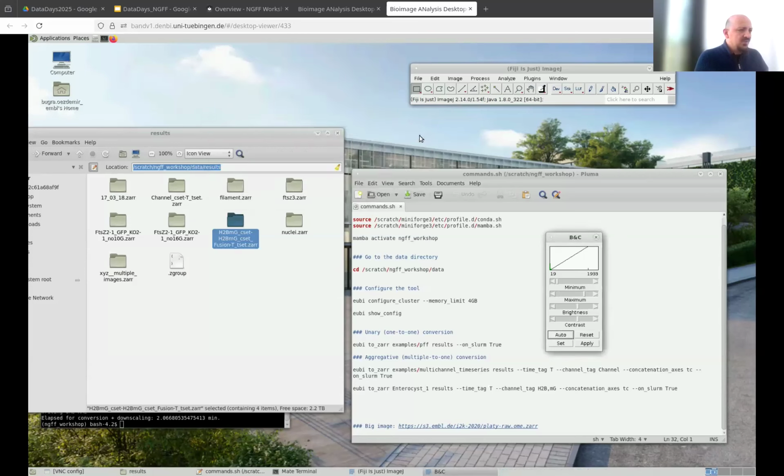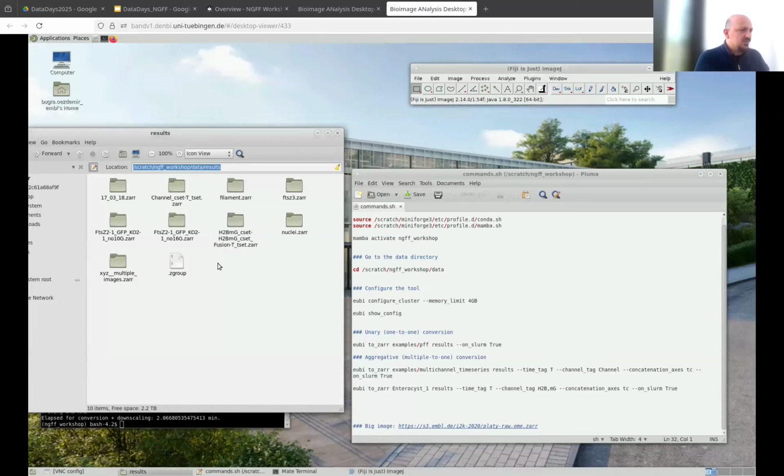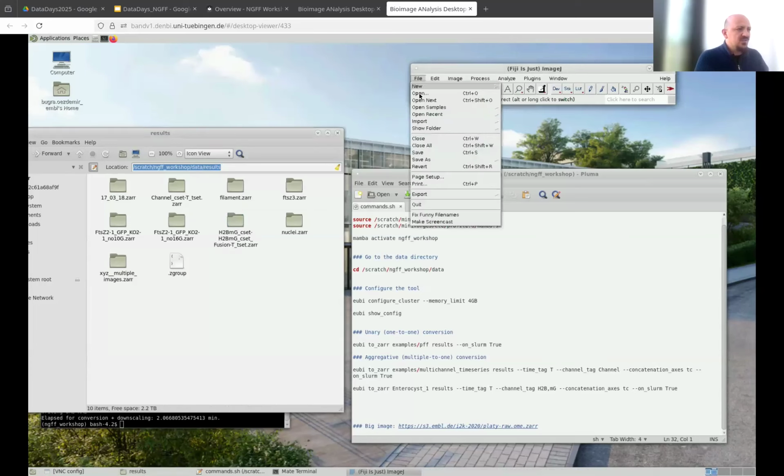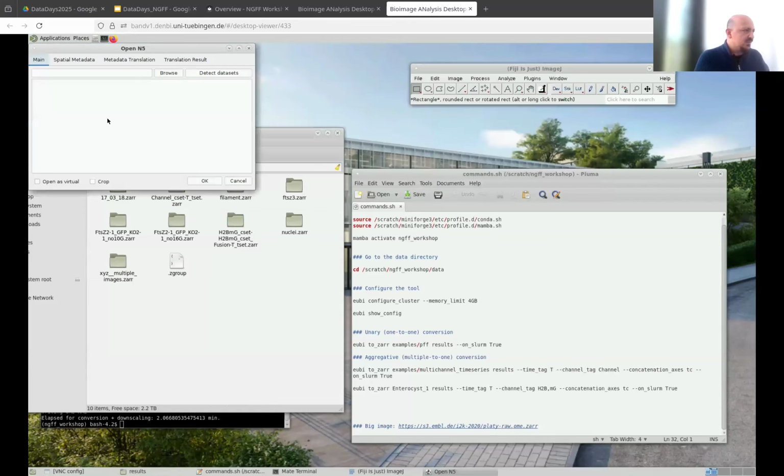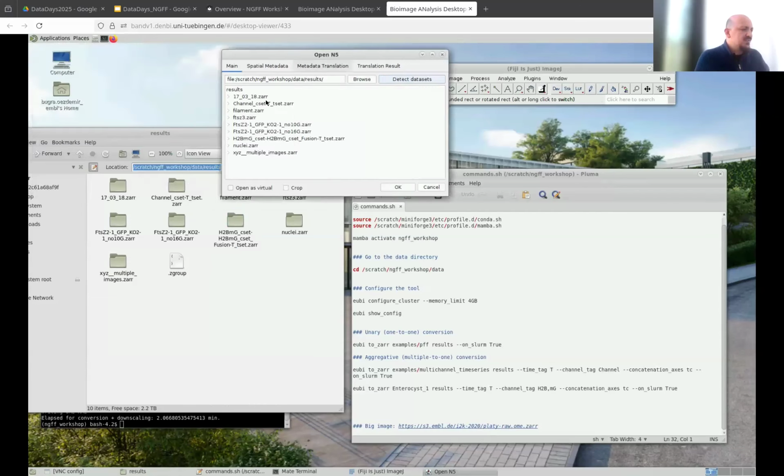An important point here is, does it also see the metadata correctly? Because as you see, when I read into Fiji, I simply choose an array. I do not really open the multi-scales. Let's see it again, maybe it's easier. So it gives me these results, and then I do not open the entire image.